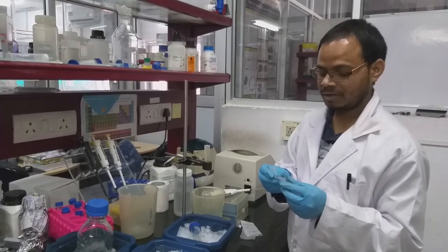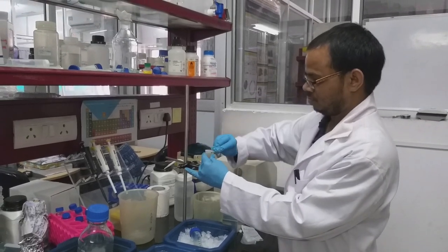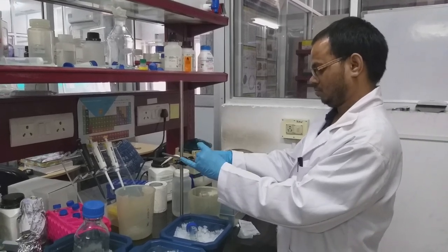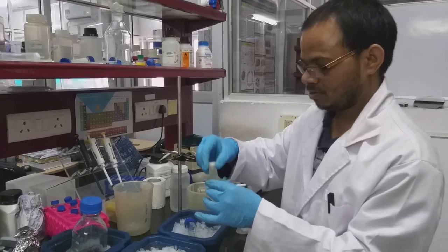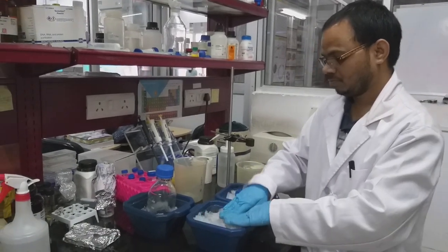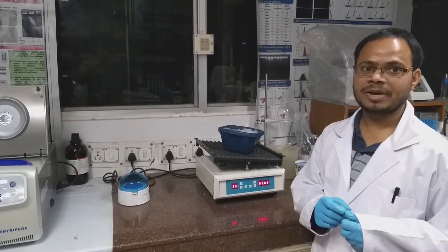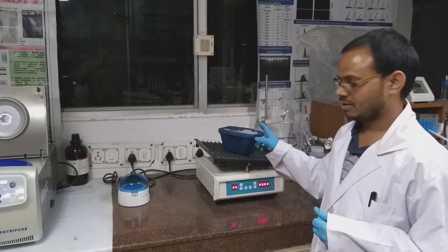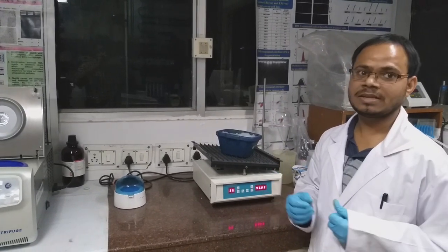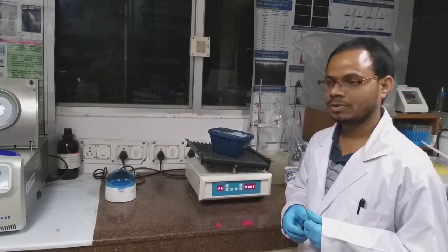This is paraffin film. I am going to close this in the pan. So once column packing is over, we keep it in ice and we'll keep it in this condition for at least 2 hours for binding. So that His-tagged protein will bind to the nickel NTA, and in further steps we will elute the protein.